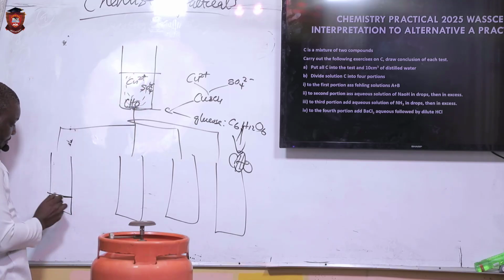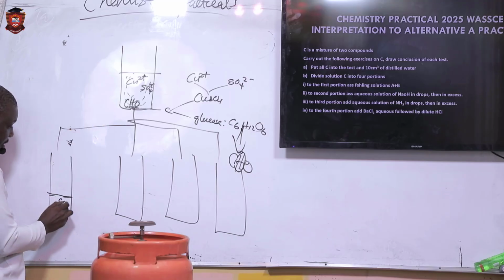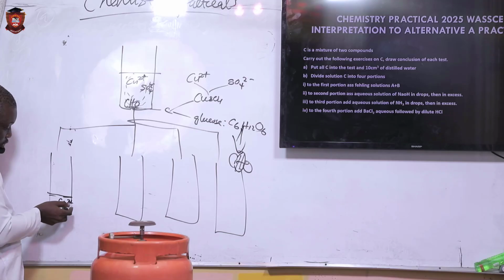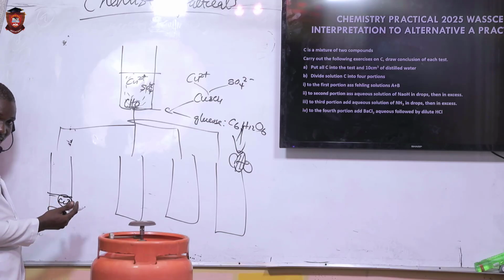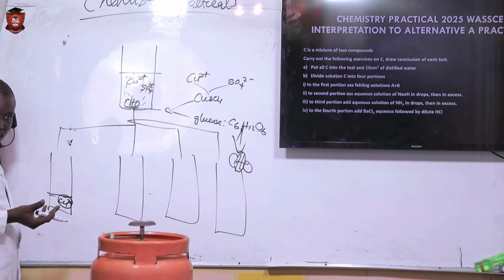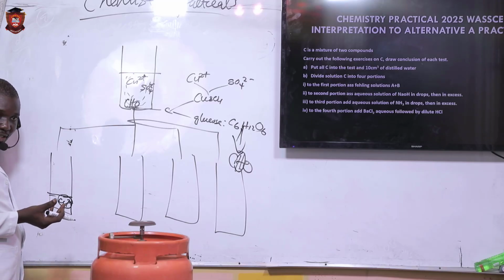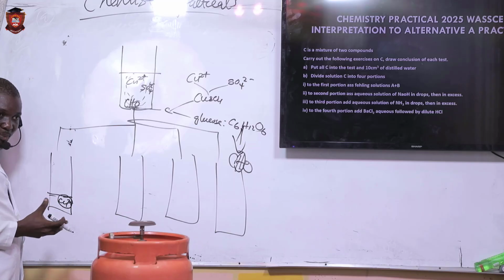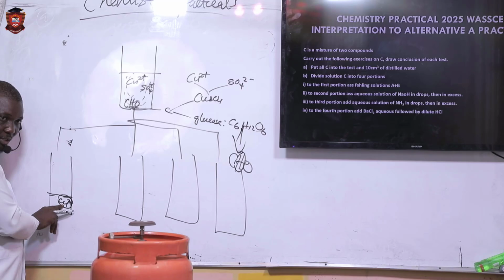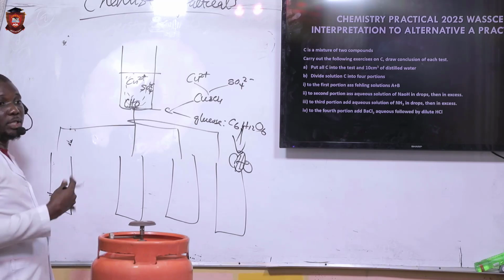All of these things are there. Since I'm testing for copper, let me just pick only copper, but all of them are there. Copper ion. Are you with me now? If you want to precipitate this, bring it out from this solution, there is a reagent you can use to do that. You can tell me the reagent that can precipitate it. If you want to precipitate this particular salt, hydroxides of copper, all hydroxides are insoluble.